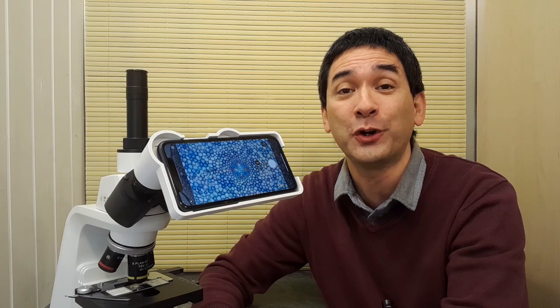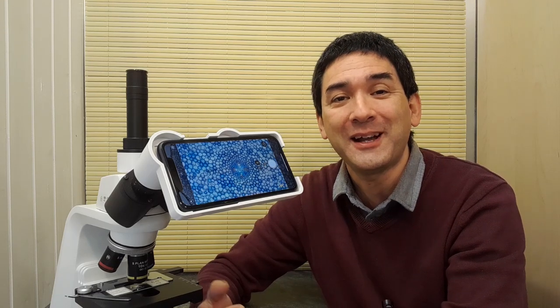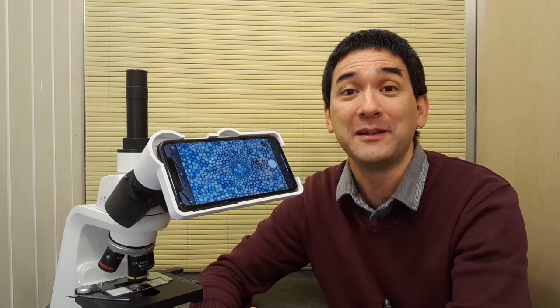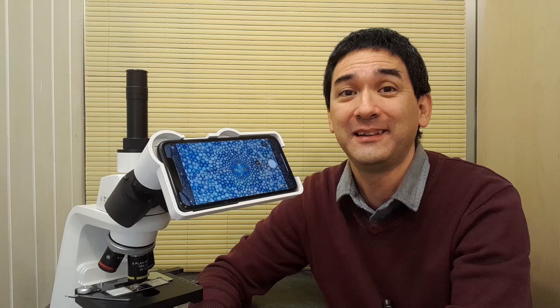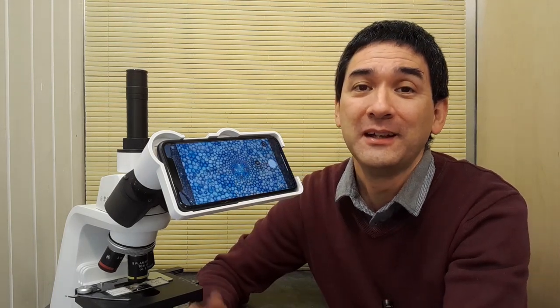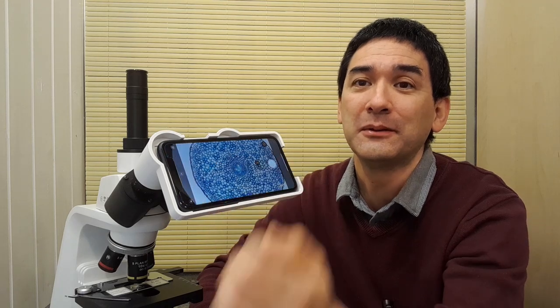I got the adapter free of charge however there are no conditions attached and I'm able to completely tell you my opinion about this adapter and I have to tell you it's a pretty good one and I think it's actually one of the best mobile phone adapters so far that I was able to review.